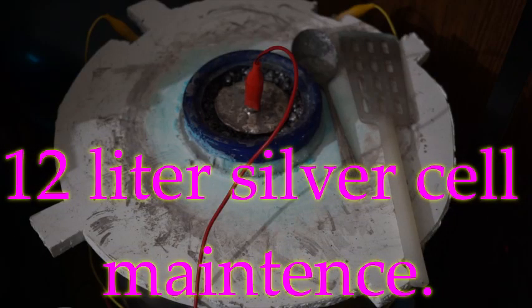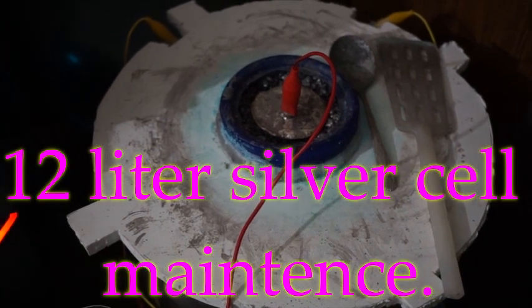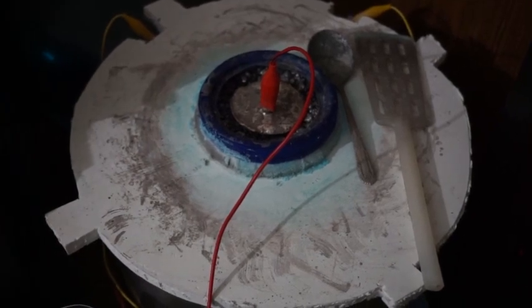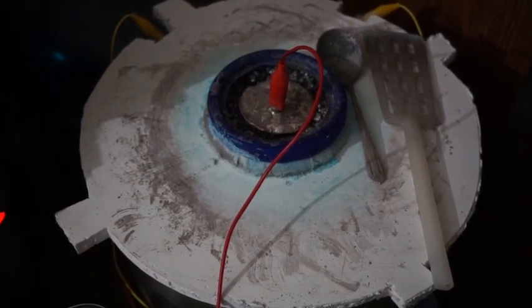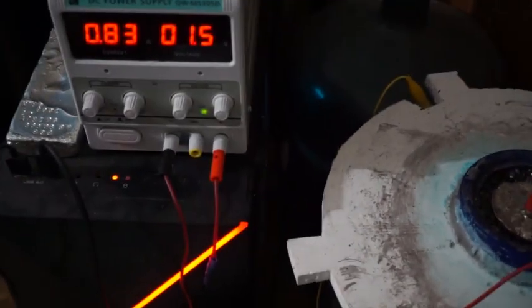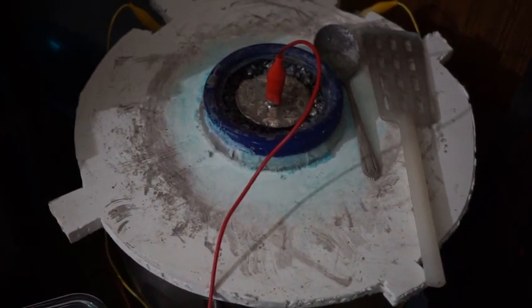Hello everybody. Today I would like to share with you an issue I'm having with my 12 liter silver cell. I have been running this cell on a fixed voltage of 1.5 volts. When I first started the cell about three weeks earlier, the current was around 1.75. Now it is around 0.83. I think something is clogging the basket.